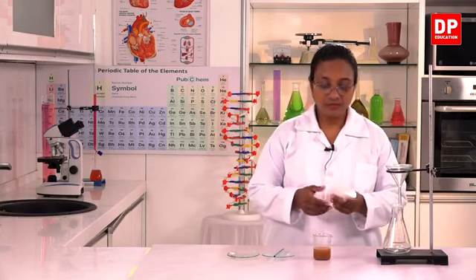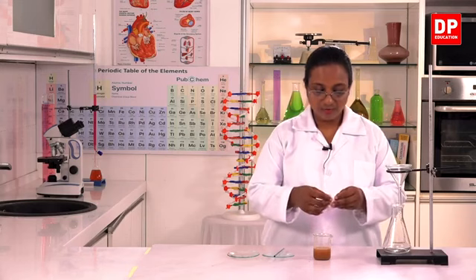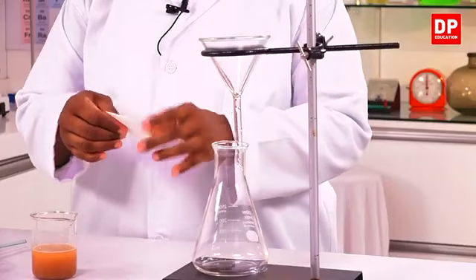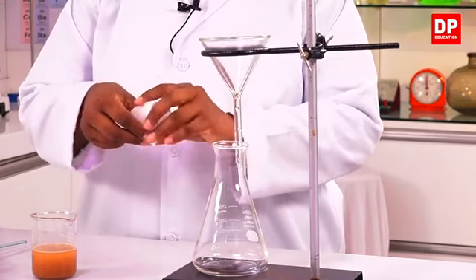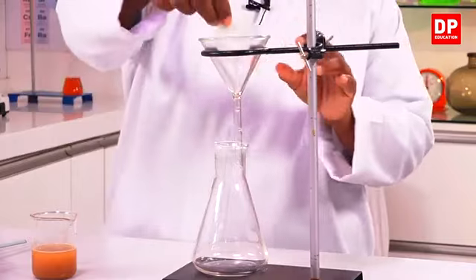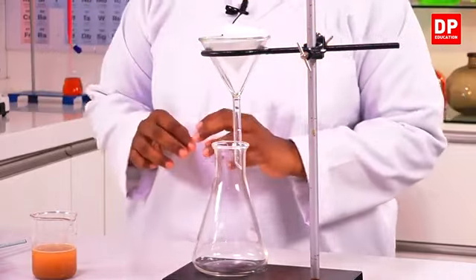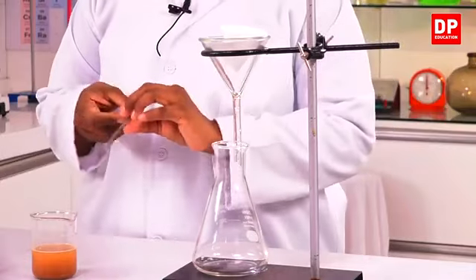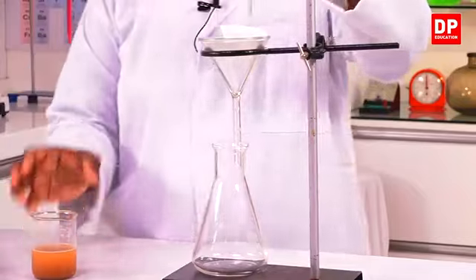So inside the funnel, I will have to place a filter paper. I will fold the filter paper like this and place it into the funnel. So here we have to make sure the filter paper sticks inside the funnel. Then to transfer the solution, I am going to use a glass rod.